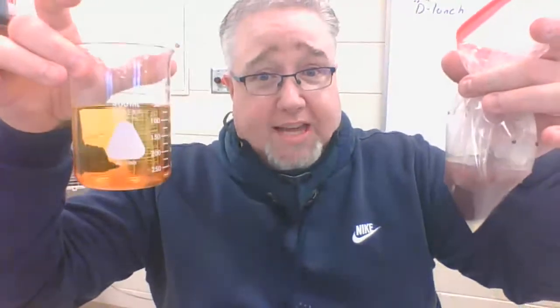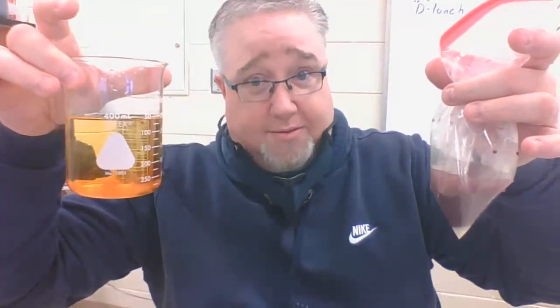So I want us to think about what happened here. I've been letting this sit for about an hour and a half, about 90 minutes, and ask yourself what happened to cause this color change inside the bag. Think about what was in the bag to start with. Think about what was in this beaker to start with.